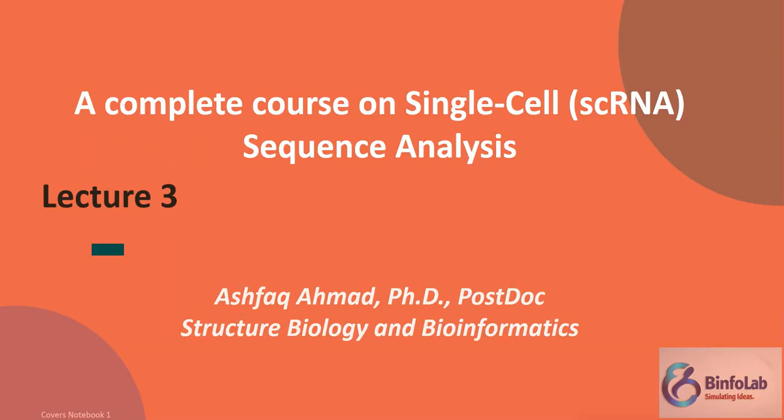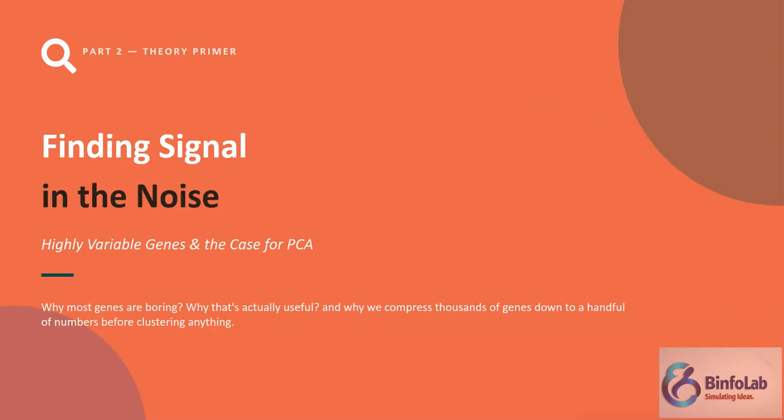Today, we will cover finding signals in the noise, or I would say PCA analysis. In lecture one, I mentioned all those steps we will go through in the practical demonstration session. So today we will talk about the variable genes and their detection with PCA.